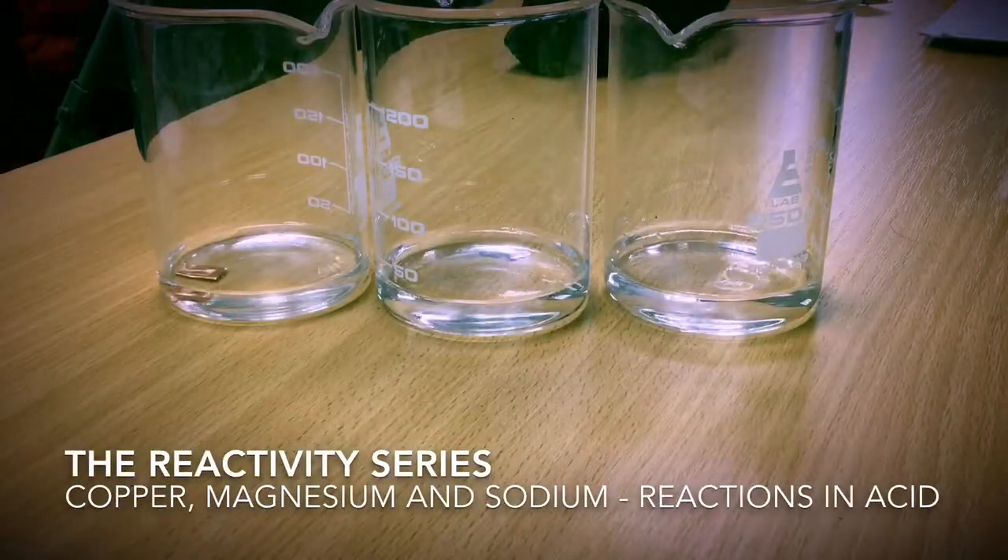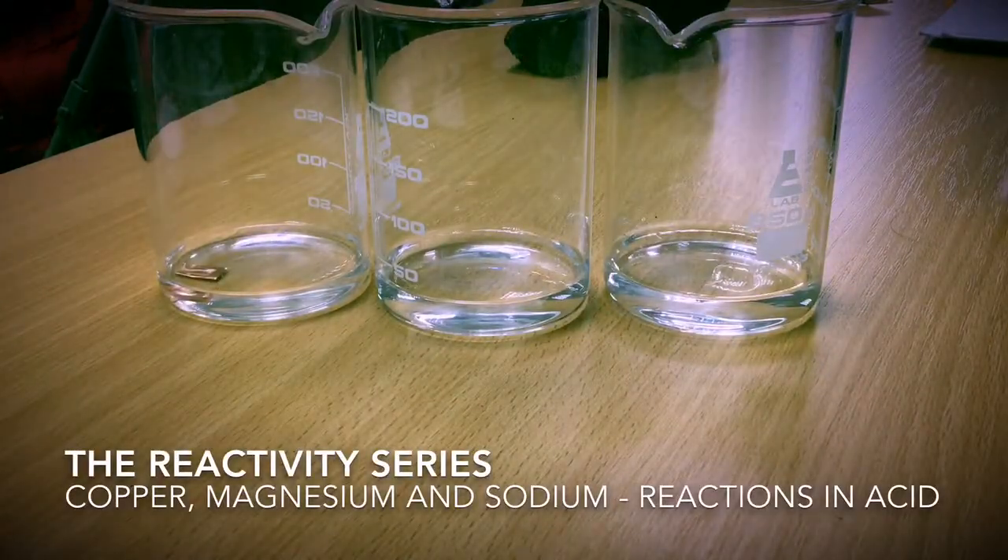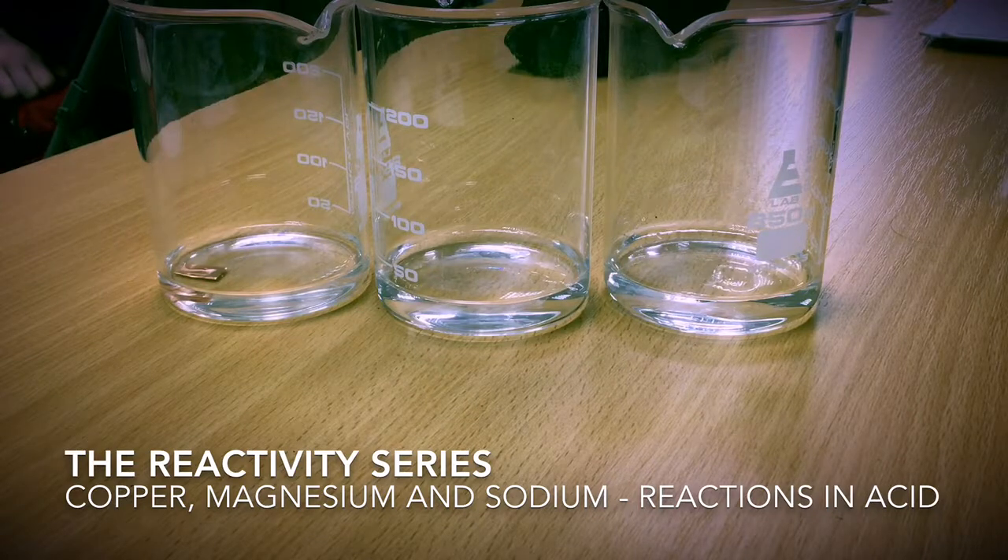The reactions were repeated, this time using hydrochloric acid in place of water. Once again we can see that copper fails to react. This is due to copper being at the bottom of the reactivity series.